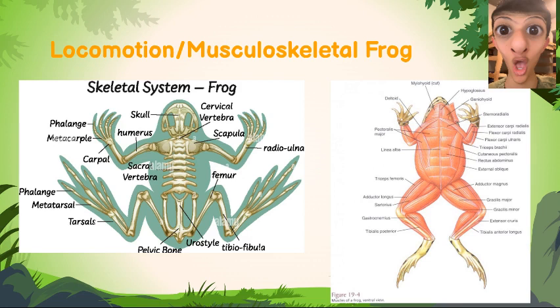Some similarities: both rats and frogs have an internal skeleton composed of bones and cartilage and muscles that are responsible for voluntary and involuntary movements. Some differences are the rat has ball joint limbs in the hip and shoulders, and frogs do not.